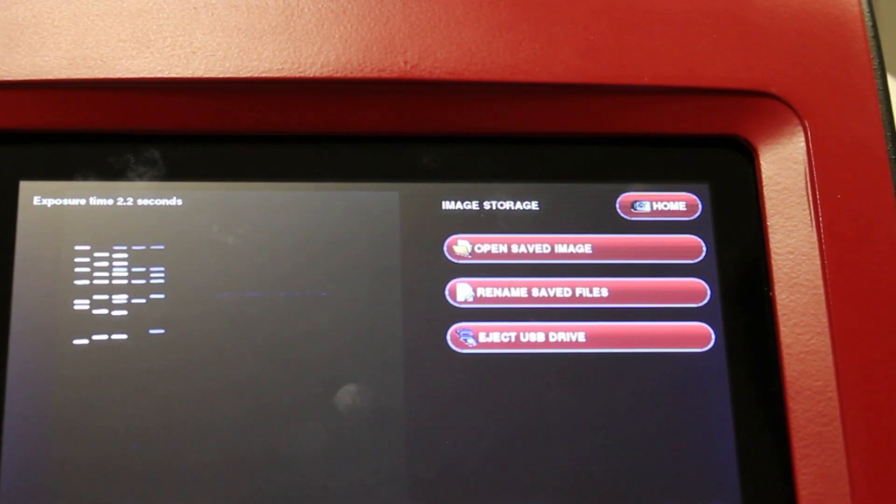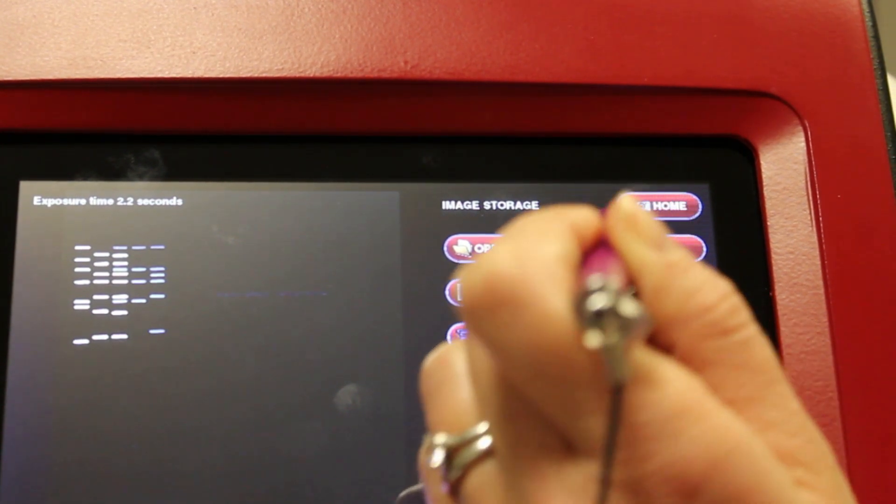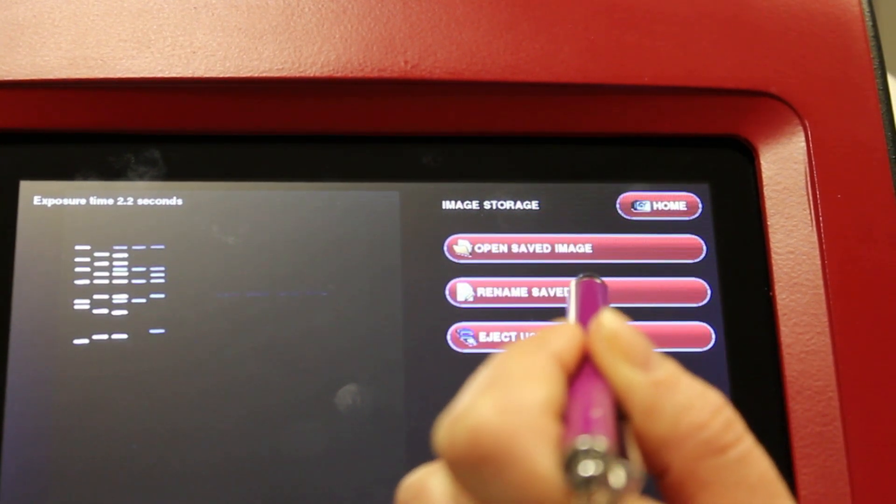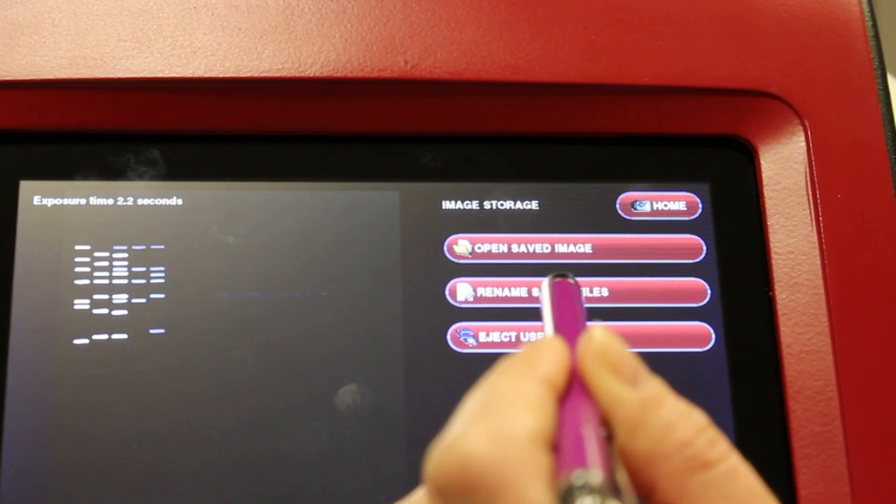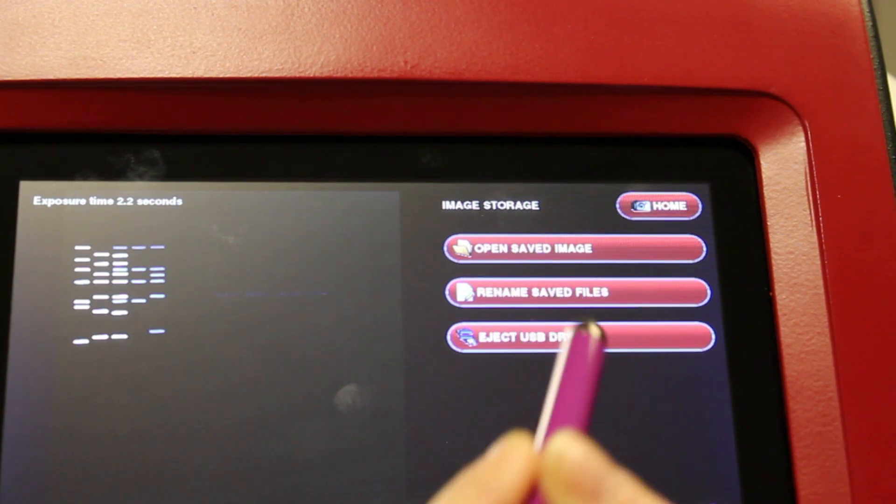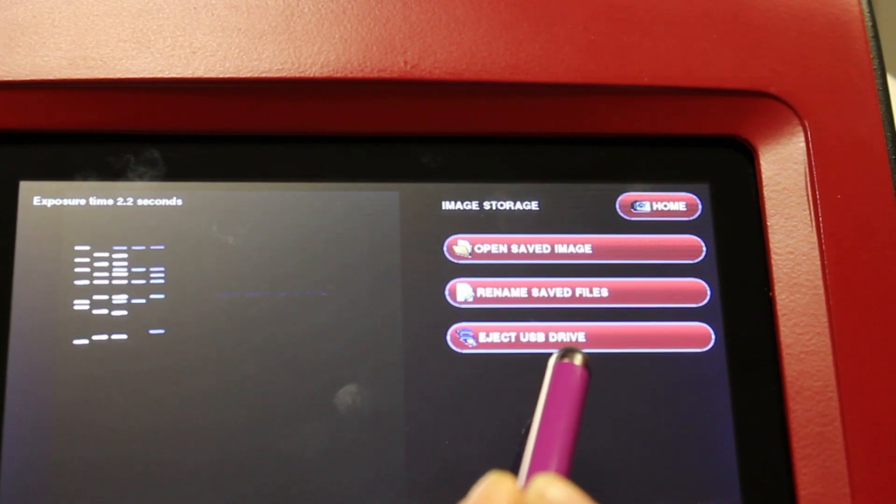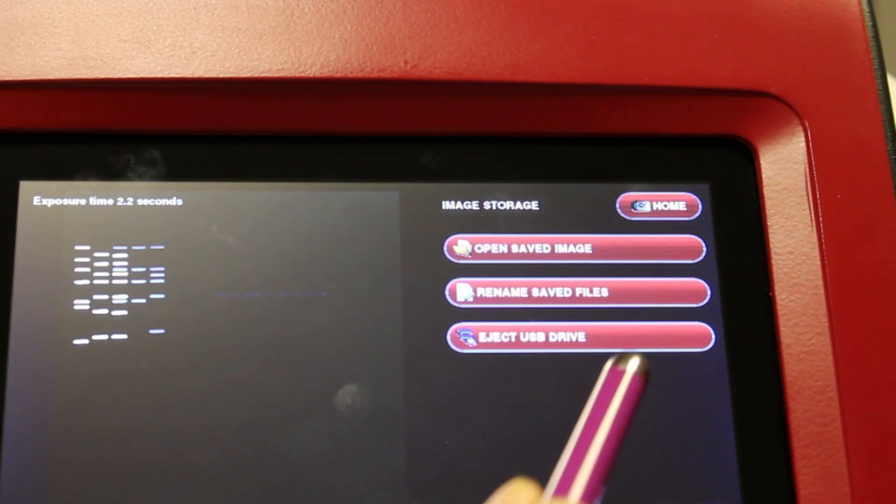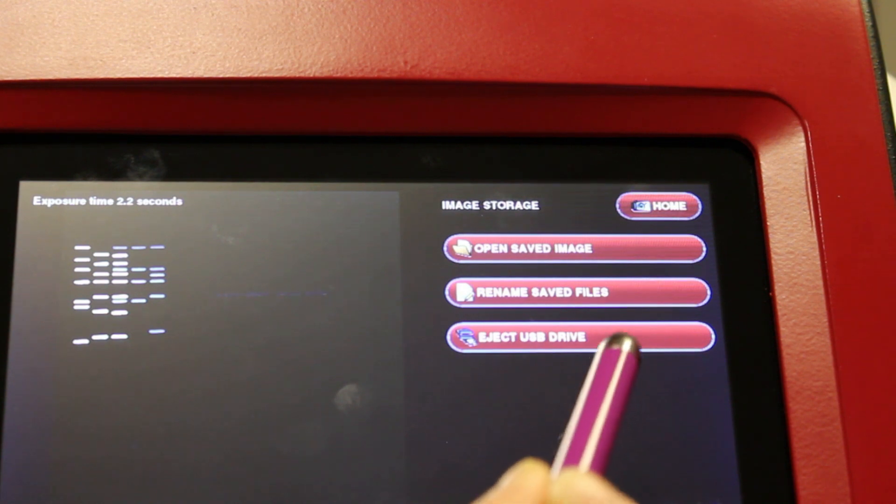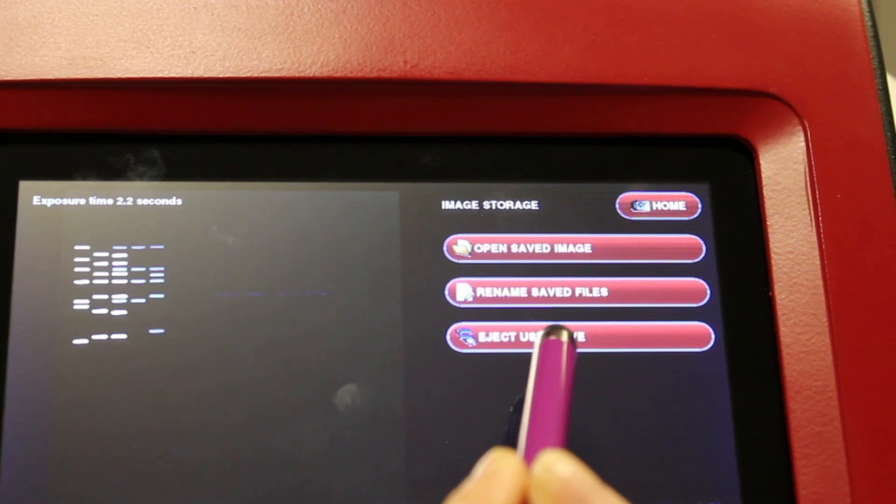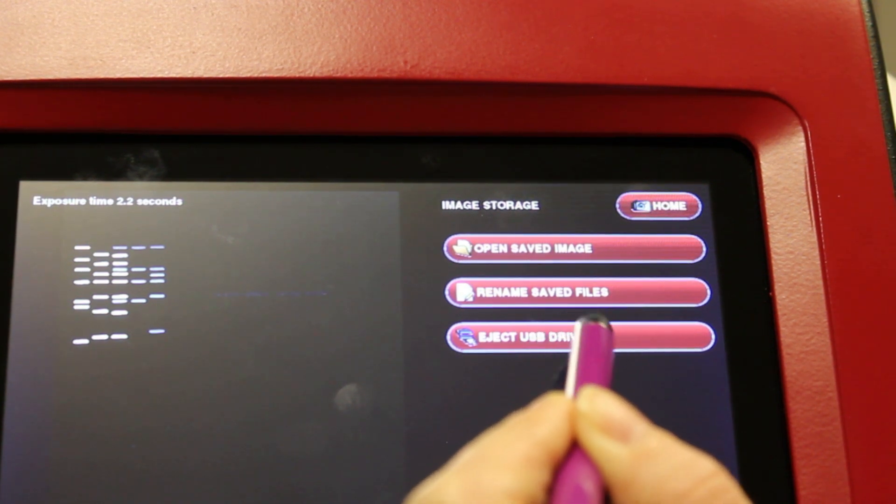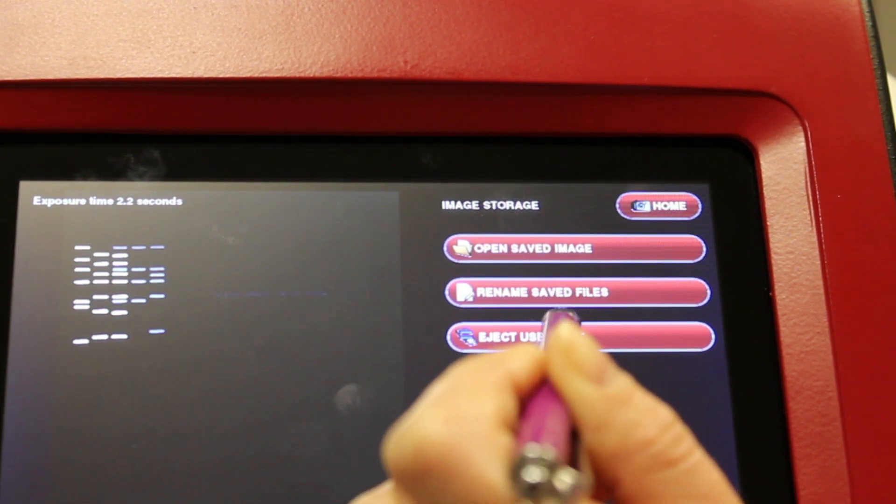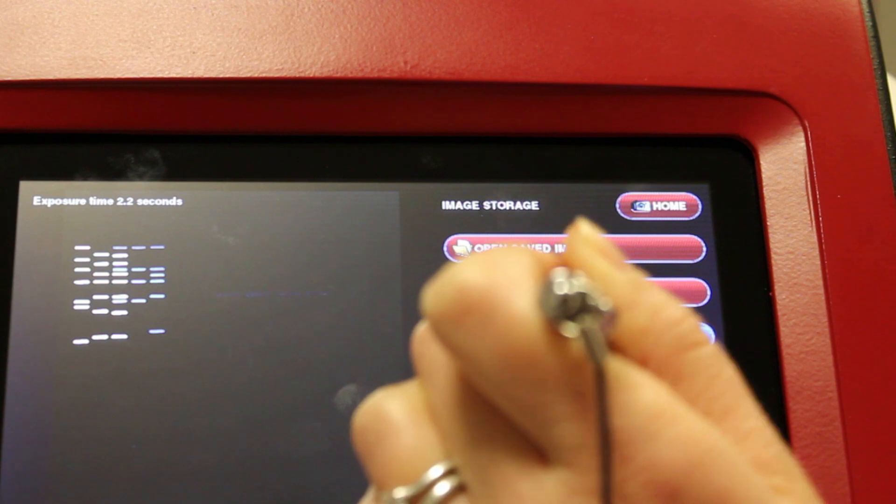When you have a USB stick connected, you can open saved images. You can also rename any saved files that you might have. We highly recommend that when you finish saving images or opening images, you eject the USB drive safely using this button here.